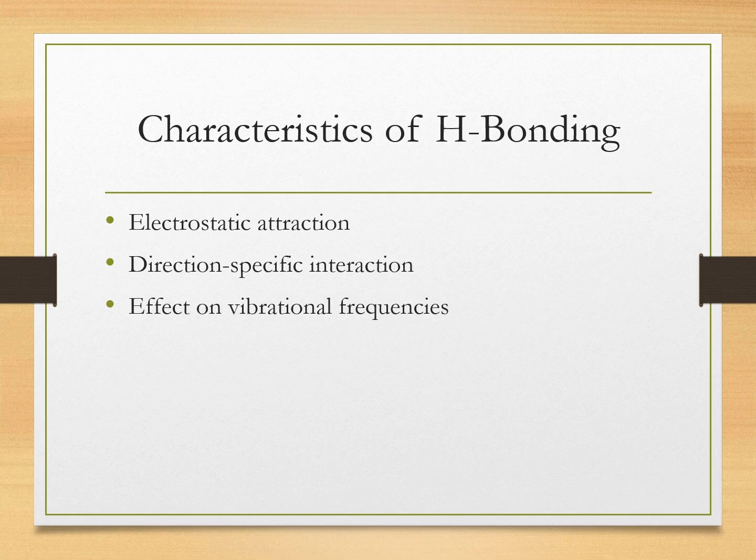Hydrogen bonding depends upon the electrostatic attraction, direction specific interaction, and it affects the vibrational frequencies as we discussed earlier.